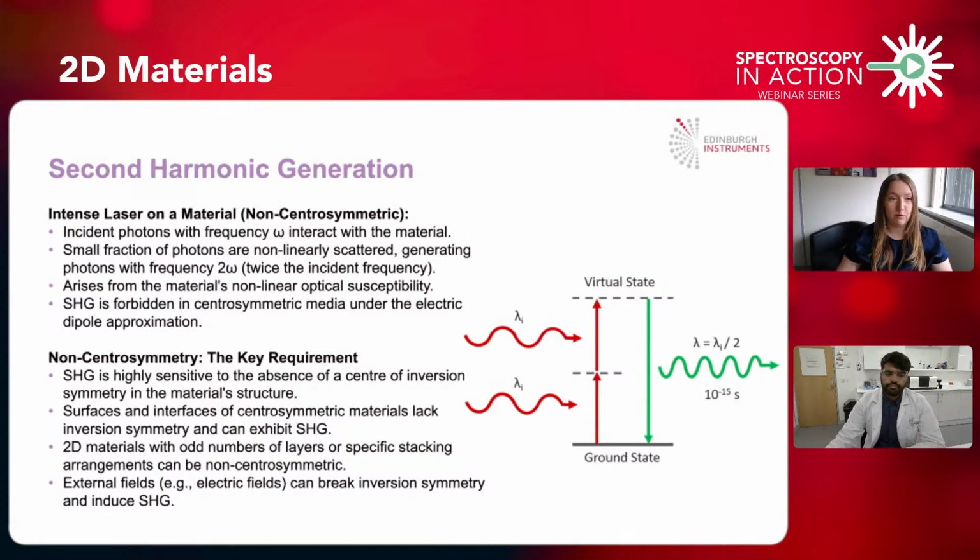As will be explained in a bit more detail by Nikesh, this is really important for knowing how your layers are stacked. As I'm sure you all know, how your materials stack will determine the final electronic properties of your material. So it's absolutely critical to know how your crystals are growing, so that you can check that your synthesis is going as you expect, and that means you can finally functionalize and use these devices in a real world application.